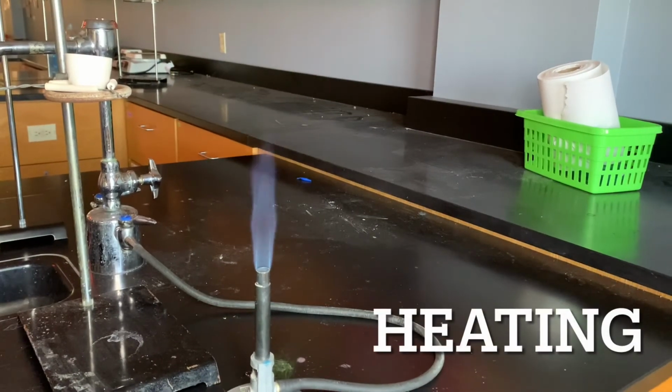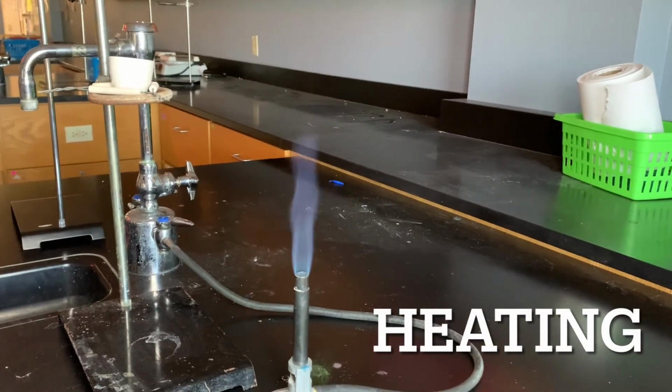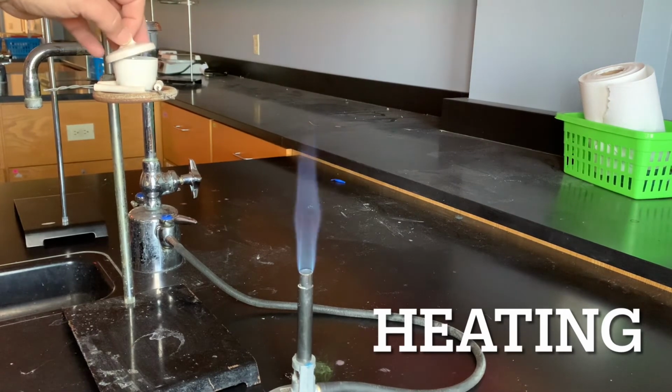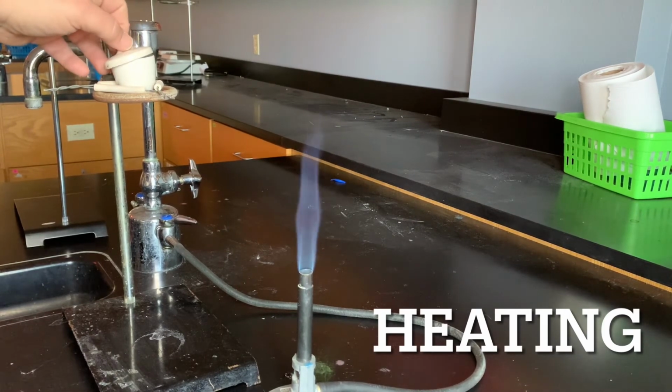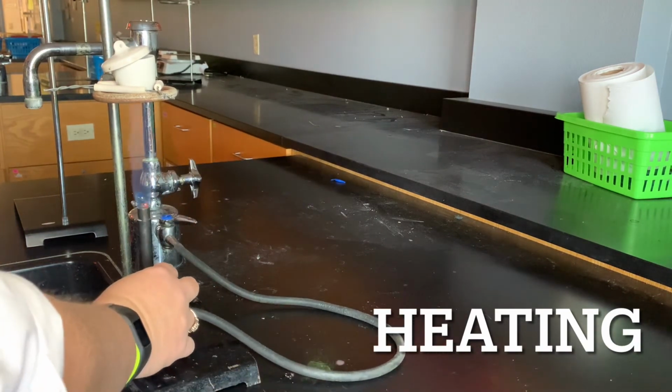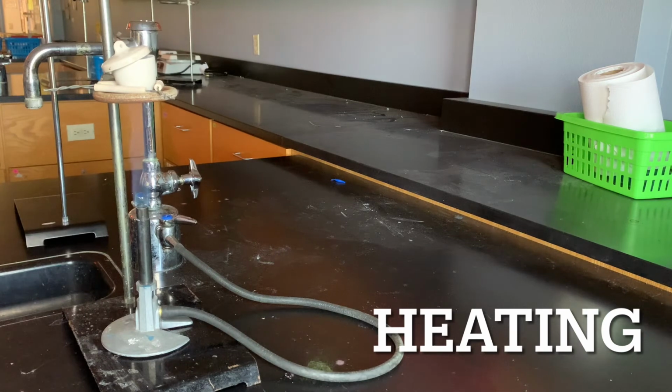Okay. So now we're ready to start this. So we can put the lid on there to start off with. We can put it on there partially. And then place our Bunsen burner underneath it. And we're going to heat it up. The reason you would like to do it like this is in case you do need to remove your lid a little bit. If you set it up right, it'll sit right there on your triangle.